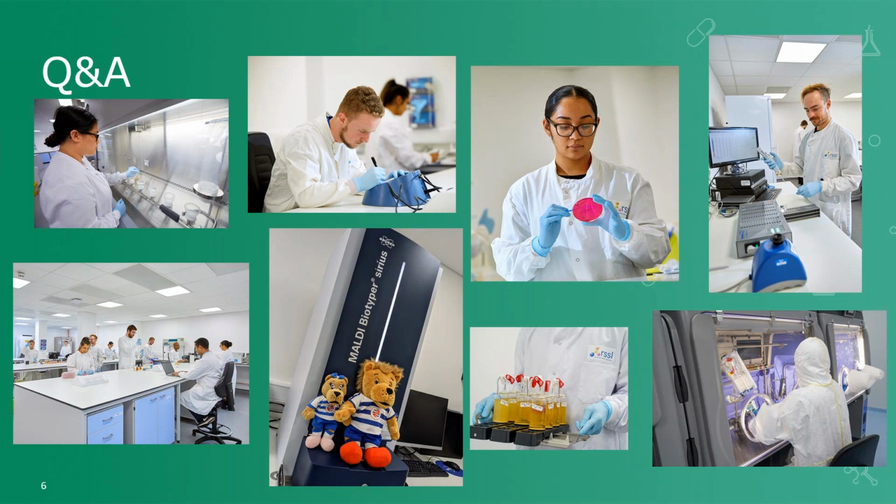I think that residues are going to become the next big hot topic relative to pharmaceutical microbiology and cleaning, where it'd be expected to show that after the application there are no residues surviving that could cause interference, product adulteration, inactivation of the next disinfectant and so on. Then water's probably a better bet, because you're introducing another factor with a neutral detergent where you've got to show that you get rid of your detergent residues as well.